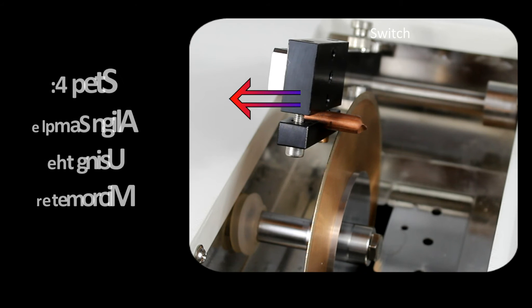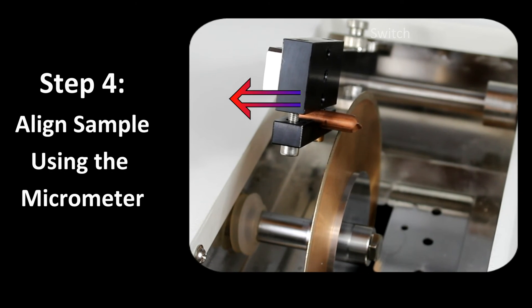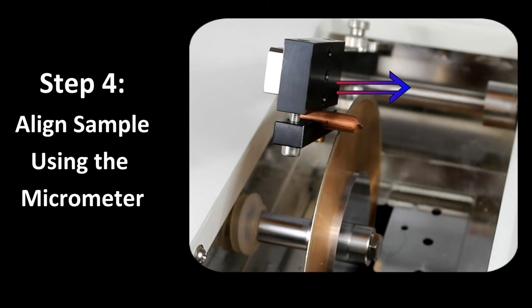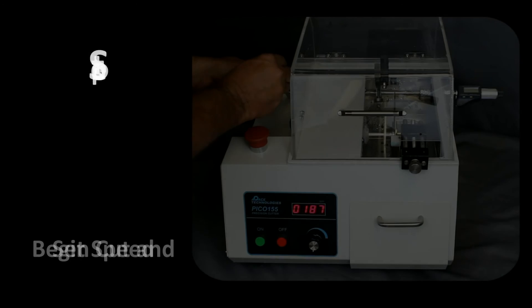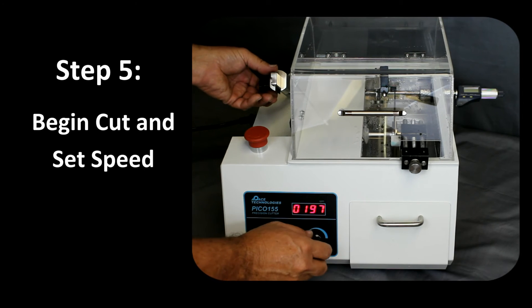By adjusting the micrometer, the specimen can be precisely cut, or multiple sections can be easily produced. Once the unit is set up, press the start button and the Pico 155 will do the rest.